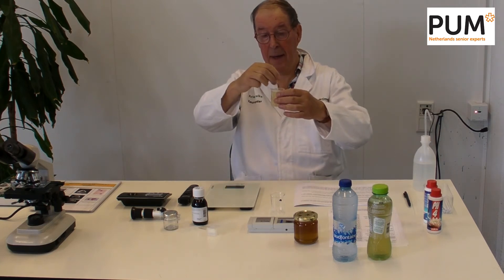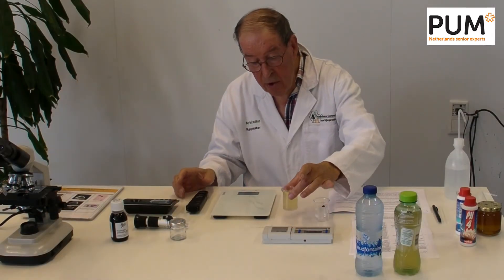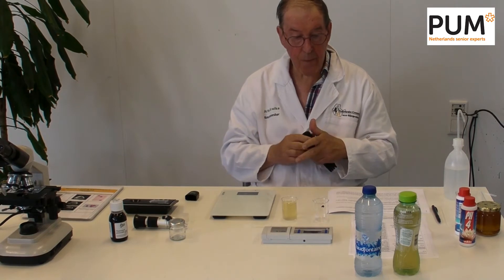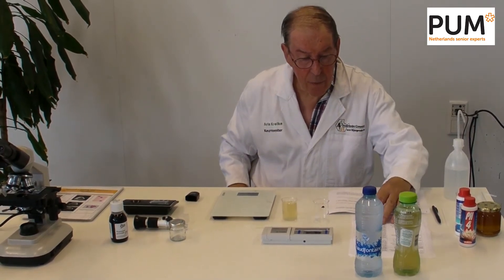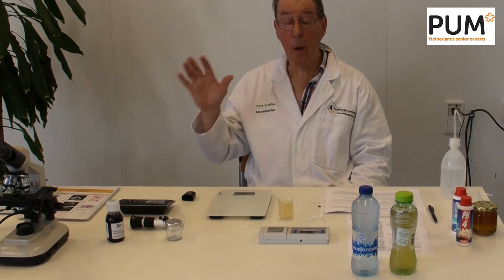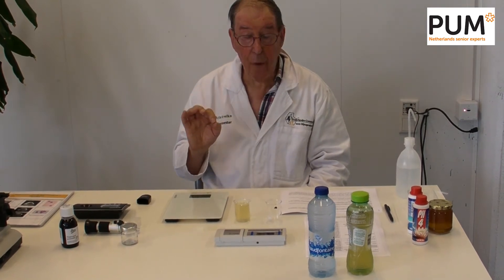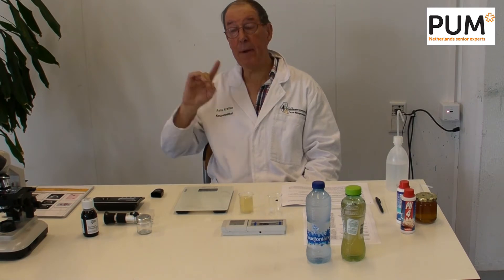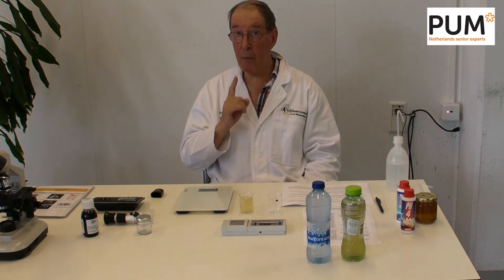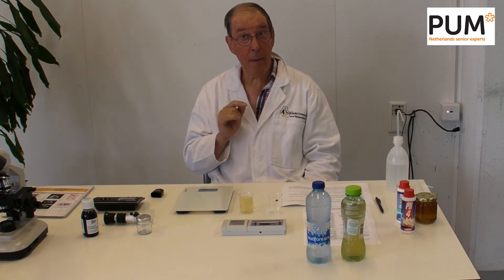We have done it in this glass jar. This solution is also used for the EC and acidity — the pH measurement. There is an international rule, the Codex Alimentarius Standard — a rule for the whole world — that says honey has a pH between 3.2 and 6.1. If the honey has a higher value than 6.1 or lower than 3.2, something is wrong and according to international law you may not call it honey anymore. It's sugar water.